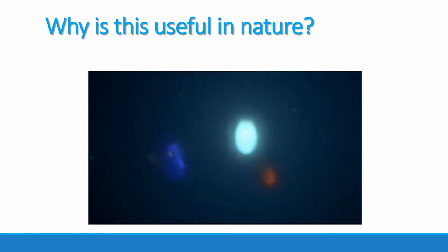Do you see anything? I see a light. A light? Yeah, over there. Hey, Conscience, am I dead? No, I see it too. What is it? It's so pretty.